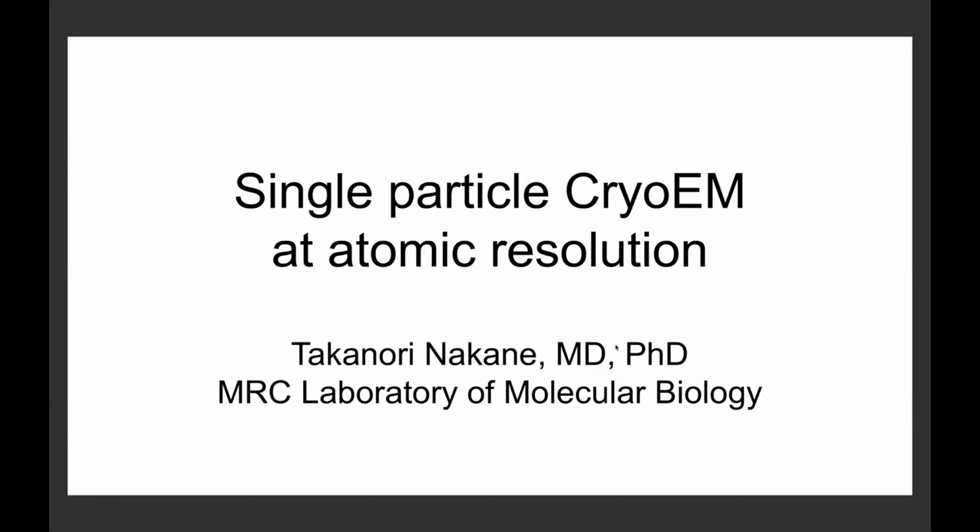Okay, thank you very much for the introduction. Today I'm going to talk about single particle cryo-EM at atomic resolution, which we presented in Nature last year.